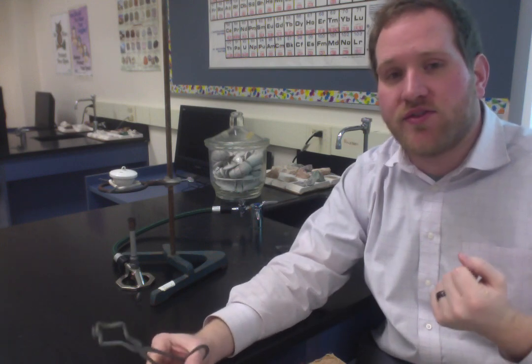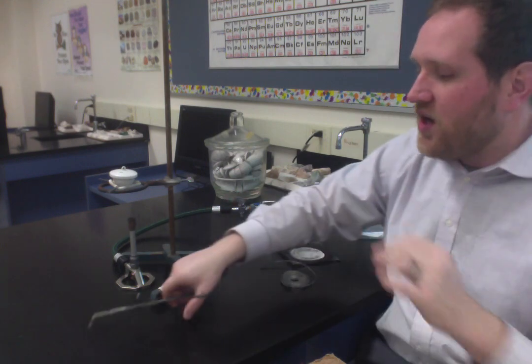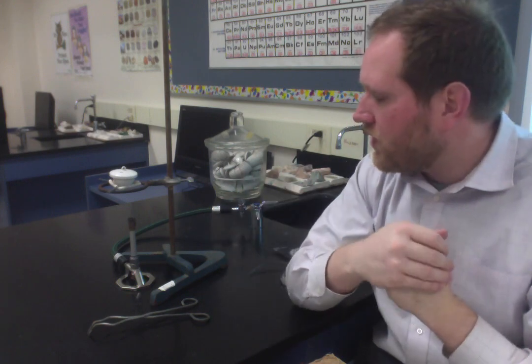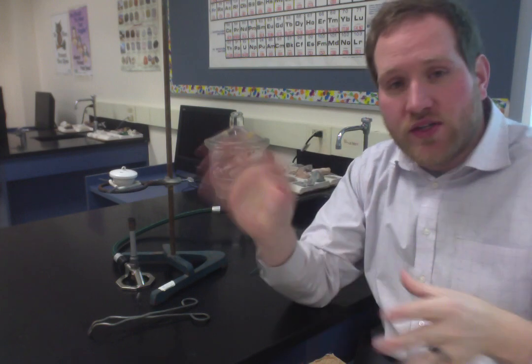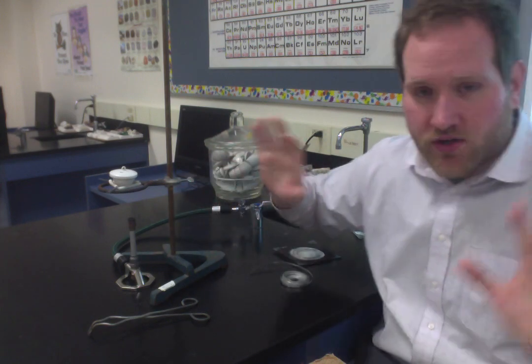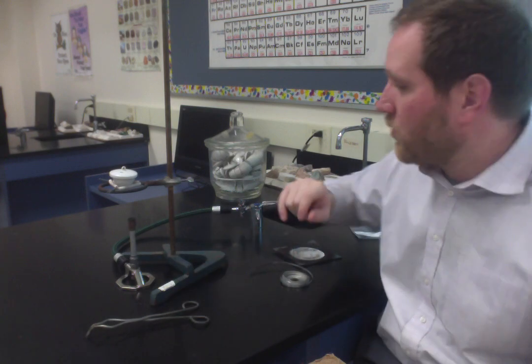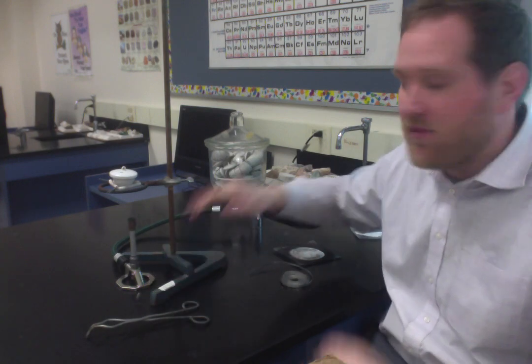Certain pieces will just happen to burn faster than others. But basically, you want to do this until the entire piece of magnesium ends up coated in magnesium oxide, which you'll be able to tell because it's a white, powdery color on the outside. Okay? Now, let's say you do this for 10 minutes or so. You're confident that you have the entire piece as magnesium oxide. Here's what we're going to do. Kill the Bunsen burner flame, and we wait.